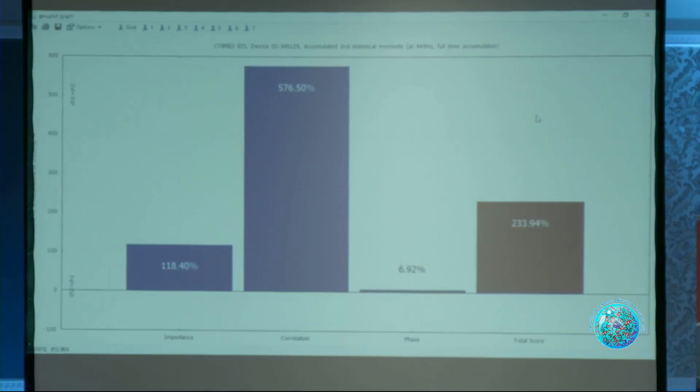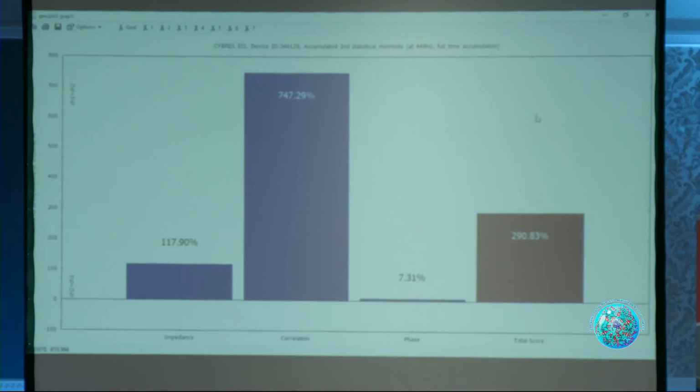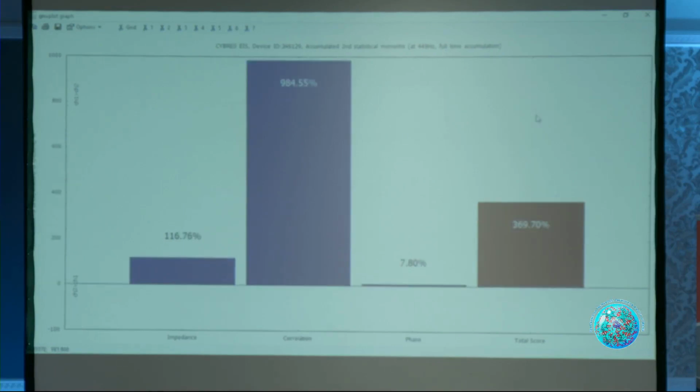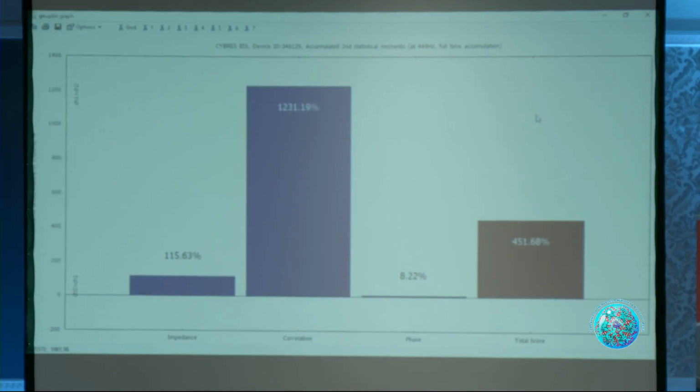So, we immediately see the dynamical ionic response of the fluid is almost 10 times different. The whole measurement took about, I don't know, 2 minutes. Of course, it should be performed under more controlled conditions, light, temperature, and so on. And I think it's basically enough.